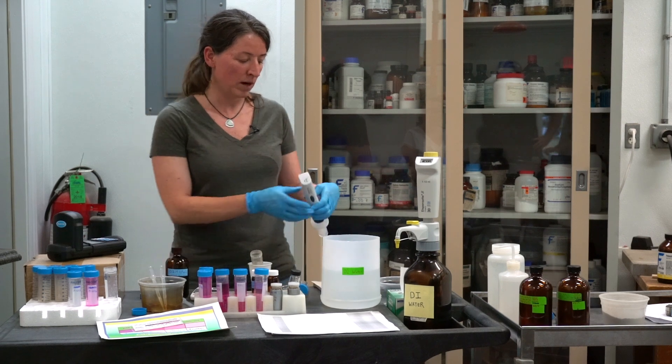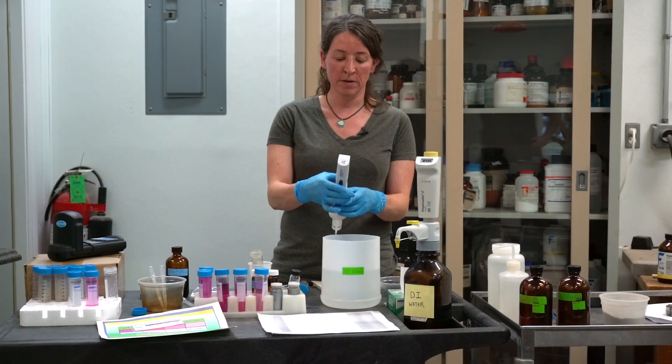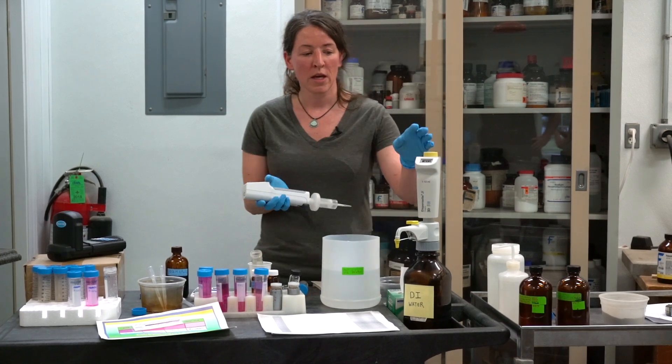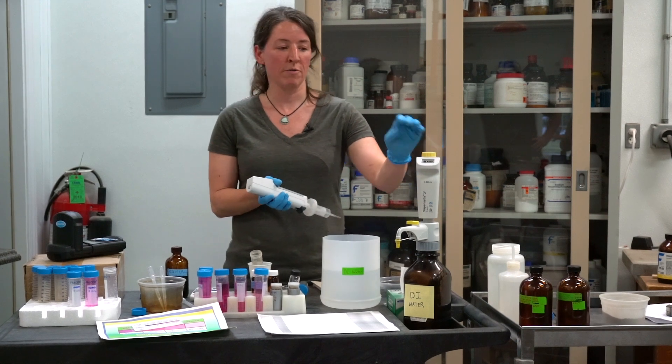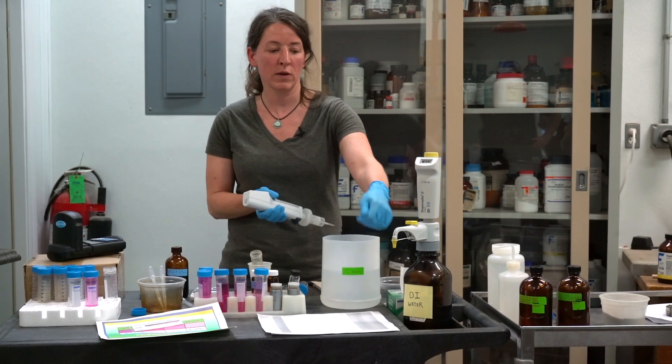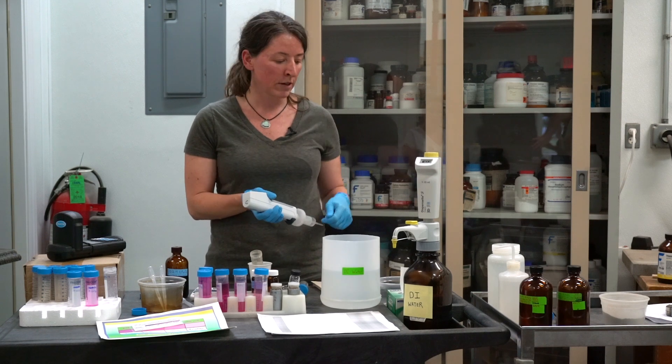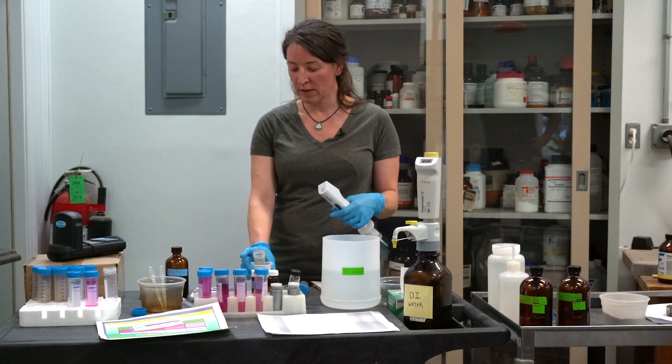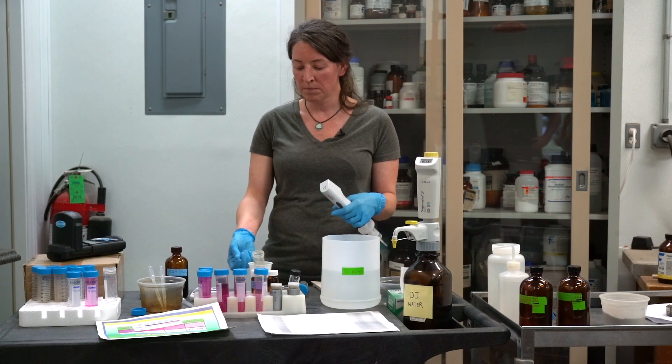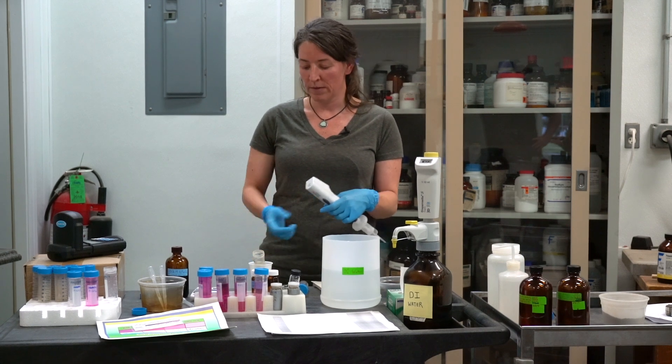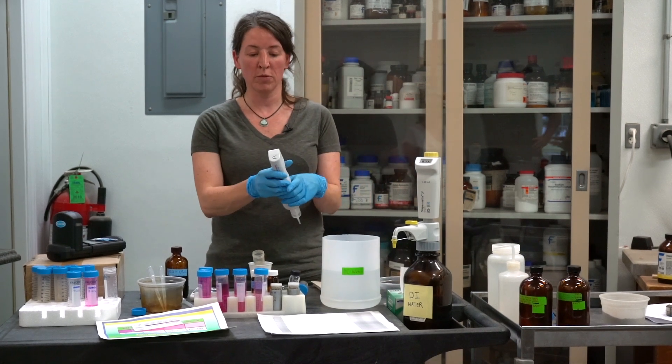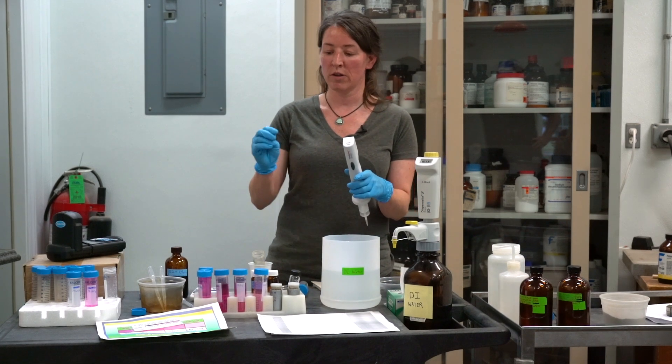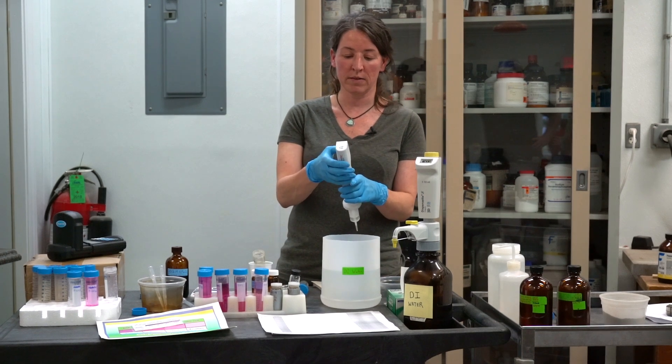We have our sample. We're adding 18 milliliters of DI water. Here at the lab, we use this handy step dispenser. You can get a bottle top dispenser that I recommend would be the quickest for you in a field event to quickly dispense 18 milliliters, or graduated cylinder, or you can use your scale. Once you have your soil in there, tare it to zero, and you can add 18 milliliters. You need to make sure that it's 18. If you get more or less in, it could skew your results.